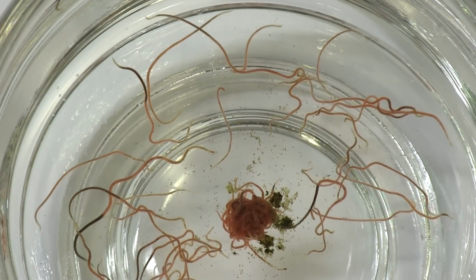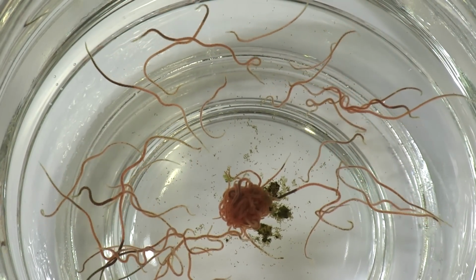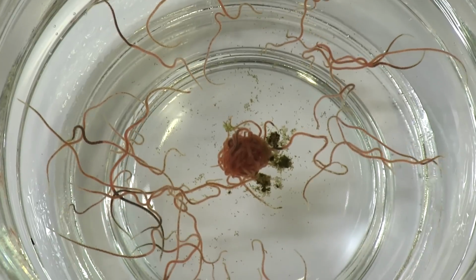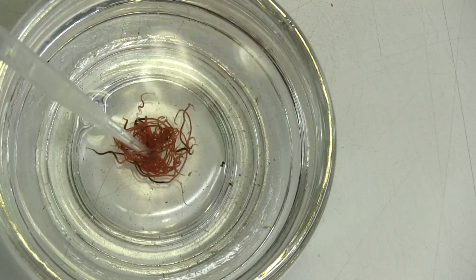After familiarizing the students with what blackworms are, have them determine what is normal behavior for one. How do they interact in their environment? Are there any patterns? And how do they interact when being gently probed?